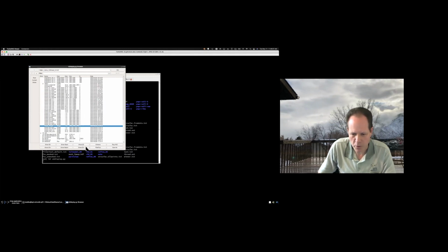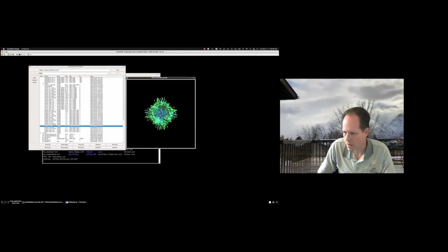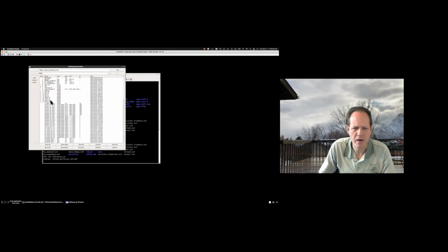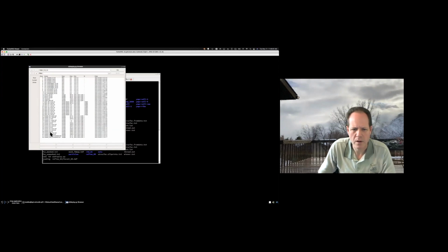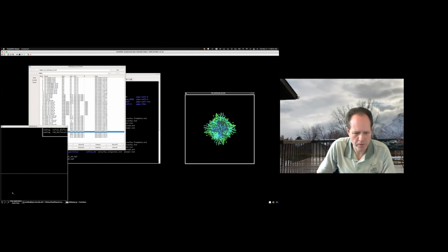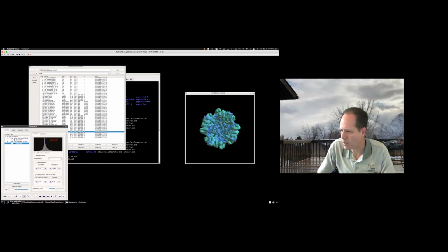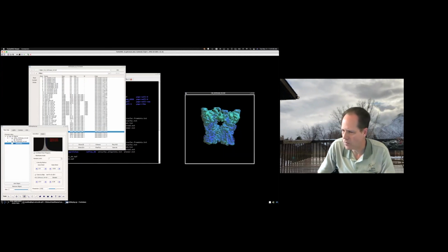What I wanted to point out is that now if you open one of these structures that was refined in EMAN in the 3D visualization module, you'll see that what you get out is colored. Oops. Actually, let me use a different one. I think that refinement didn't go. Let me try this one. This looked better. Oh, sorry, I got both of them. There we go. So you'll note that the structure comes out colored, where it wouldn't have previously. It would have come out looking like that.